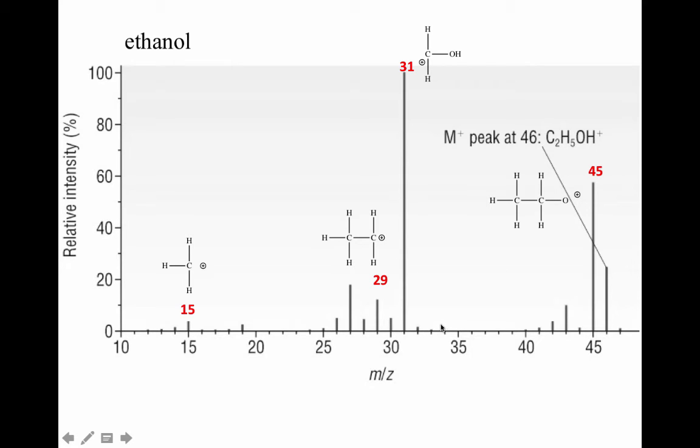All right, so let's look at a mass spec and see what it has to tell us. What you do is you look over here for the highest molecular mass, and this is our M+. This is the highest molecular mass, so that has to be the biggest piece that was detected, that has to be the entire molecule. Remember that it is going to have that +1 charge. You can see just this little peak here, and that has to do with there being that carbon-13 isotope. All right, so that's the M+1 peak. This is your M peak.